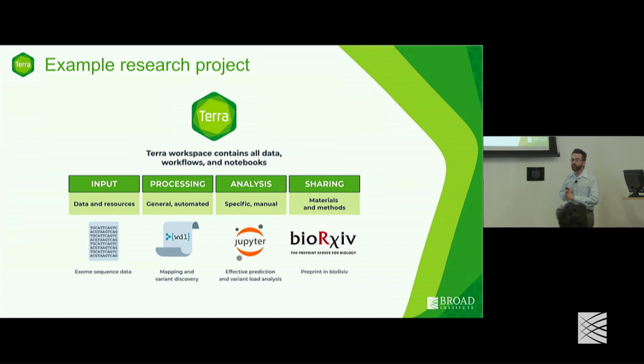So that's step one of the process that you can do inside of Terra. Let's say that you then wanted to do some of the processing that we all know is very important. So you need to align your sequences, then whatever other types of steps are necessary for that particular project. You will be able to do that also through Terra. There are WDLs actually contained within the workspaces.